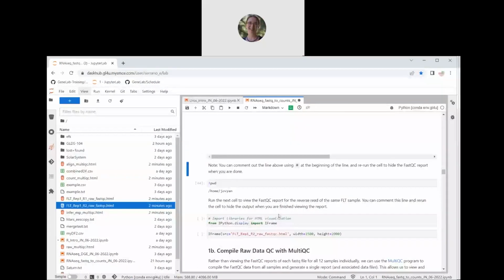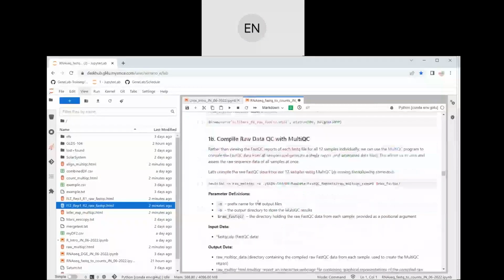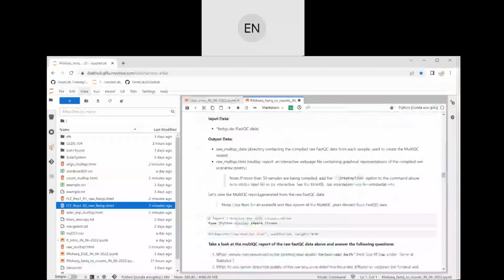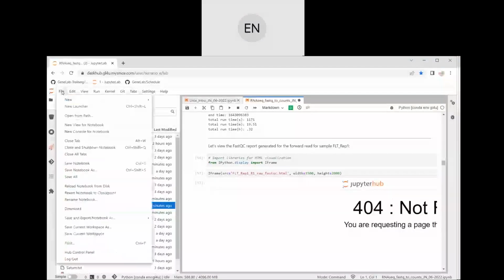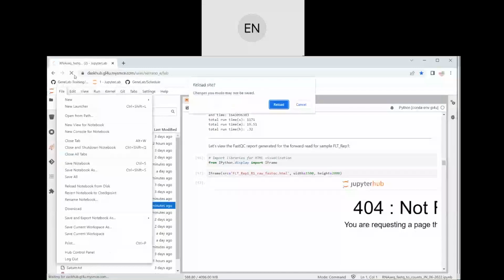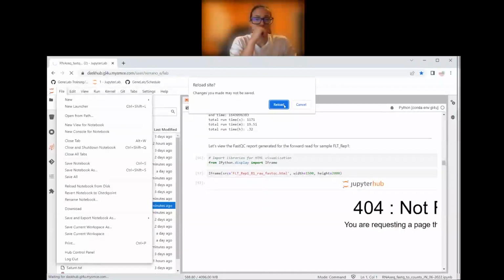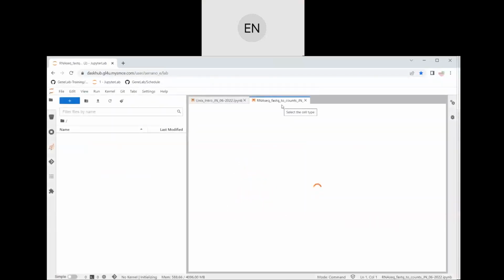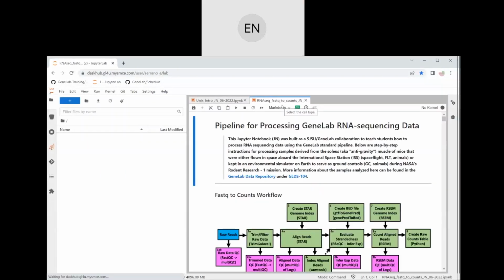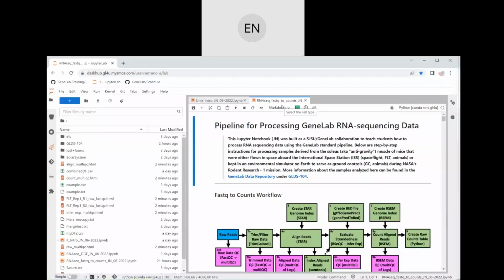And here it is again. Run the next cell. Let me try it again. Huh. Why don't you try restarting your hub maybe? I don't know why it just wouldn't. You could log out, or you could just refresh your browser. Reload. The HTML files are still there, they should all be still there.